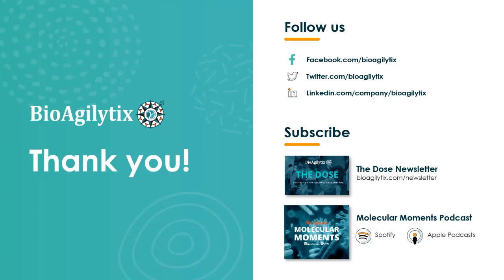That's definitely an advantage. But other than that, I think for sensitivity and precision, they're comparable. If the instrument is suitable for your purpose, you can use the instrument you already have. But if you're running a method for a long time and you don't want the burden of managing the reference standard, digital PCR definitely has an advantage from that perspective.